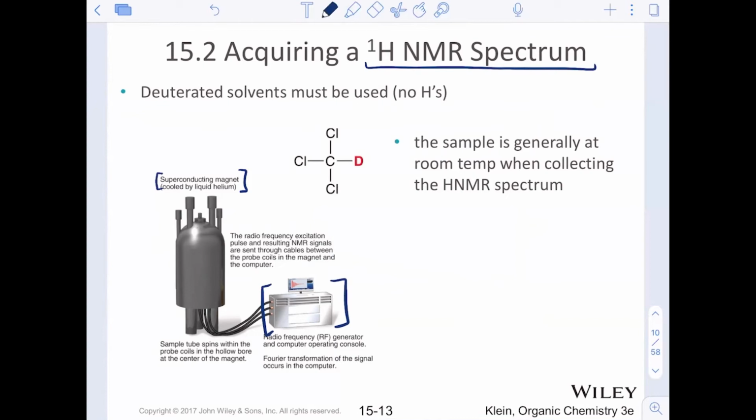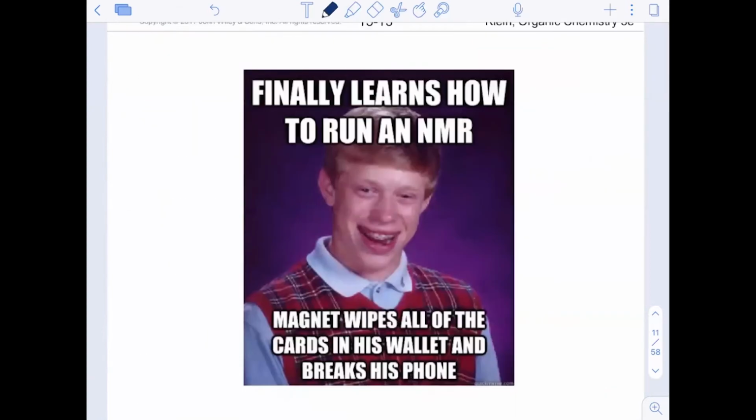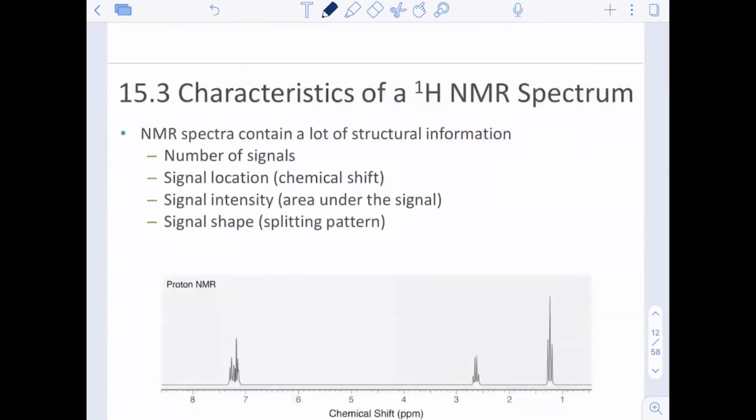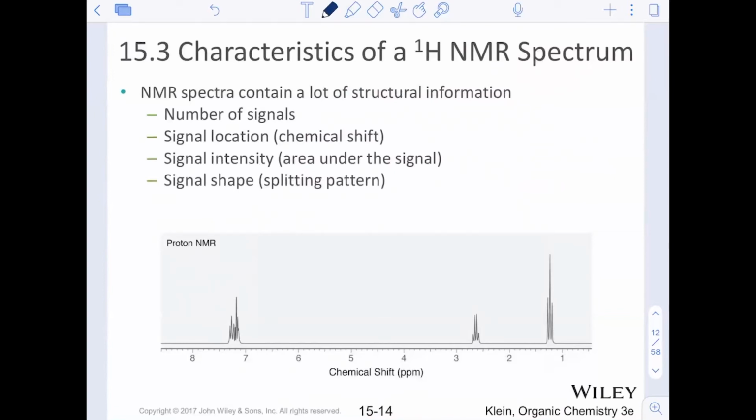In the lab, if you get to go into the lab and see the NMR, it's really important that you understand it's a huge, huge magnet. So be really careful about your credit cards and your wallets and your cell phones. Yeah, it can demagnetize things that are also magnetic around you, right? So usually jewelry or wallets or cell phones are not allowed in the NMR, as long as it's a big one, right? Very expensive unit.